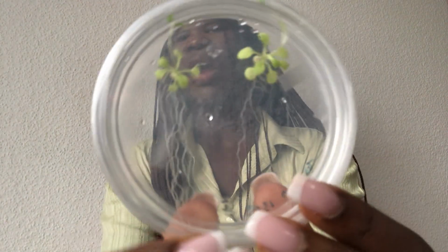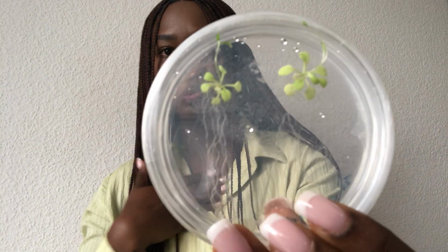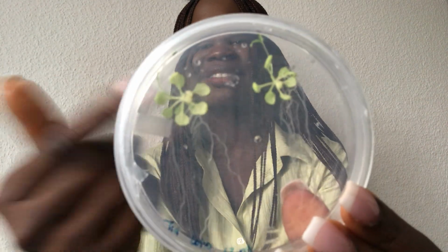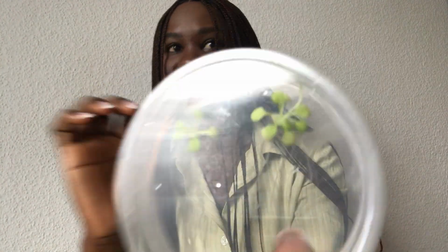So it makes it easier to work with, and also the plant itself is quite small. So we were able to put 2 plants in this petri dish, but it's because we choose to put 2 plants depending on the demands of your experiment. Sometimes you can put more, but this is the entire plant. This is even ready to flower right now. So we can see that the plant is very small and very easy to manage.